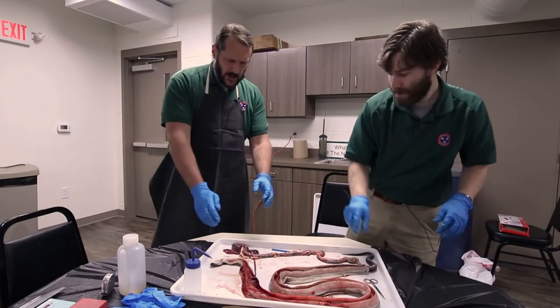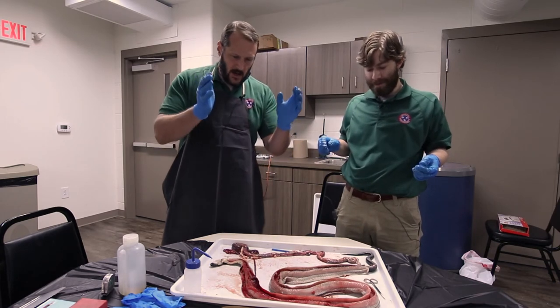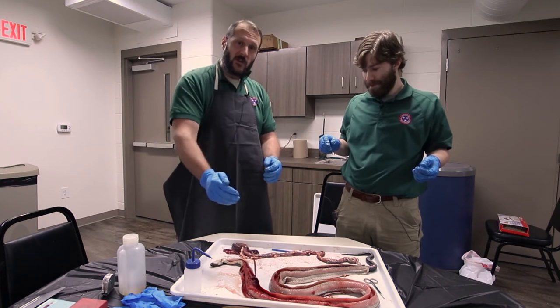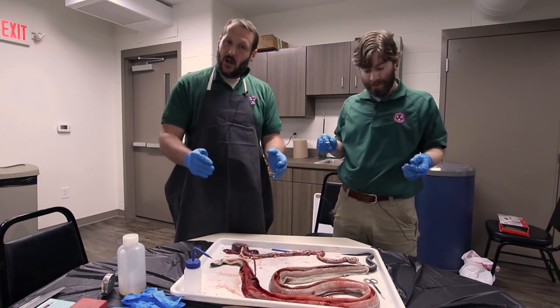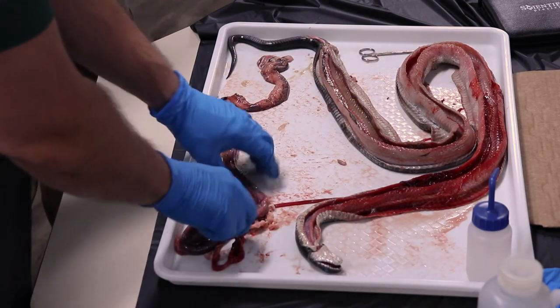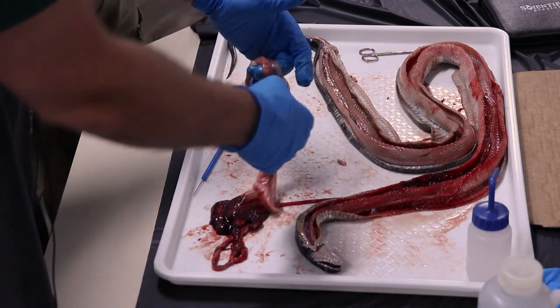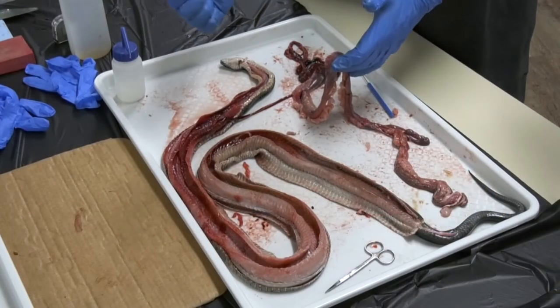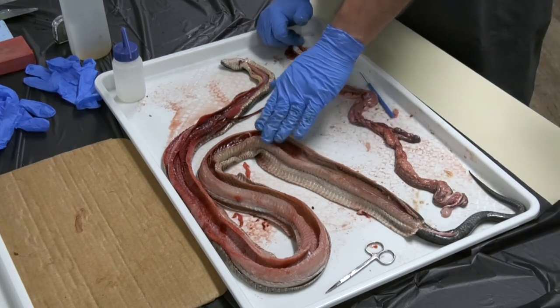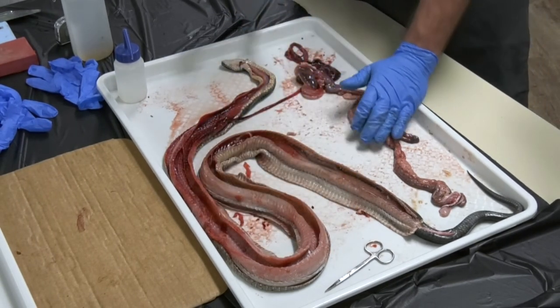All right, so this is a great time to tie this in and actually be able to compare apples to apples, vertebrates like this snake to a lot of the other animal kingdom. So you notice that Lance here just expertly peeled out all the viscera in a single, you know, that horrible sound, all the way out. And it's left just a singular, now empty body cavity behind.